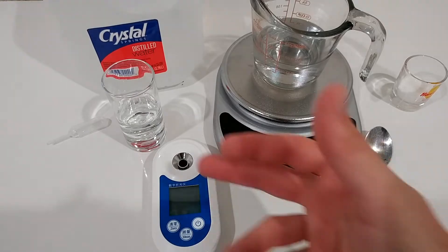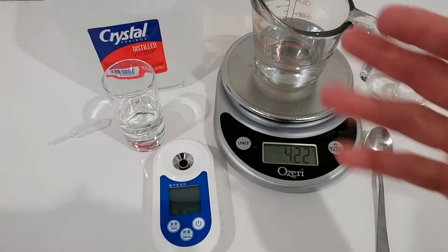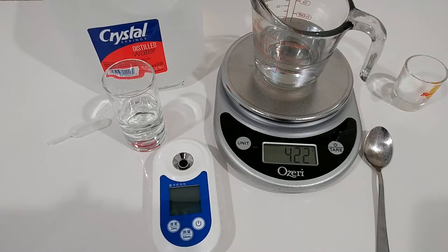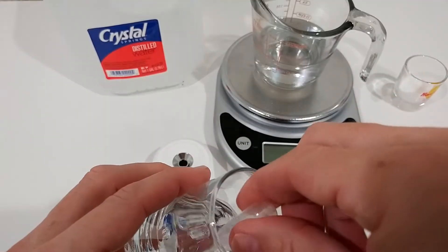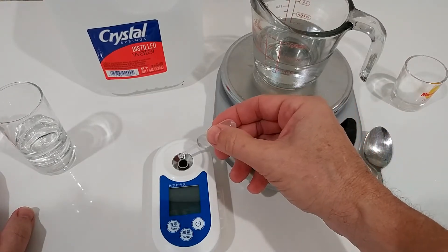Two things are really important before using this device. It has to be calibrated to zero using distilled water, and the temperature of the device and the liquid have to match — or you need to wait at least 20 seconds for the device to adjust. Everything has to be very clean, and we use 0.3 milliliters, which is six drops.